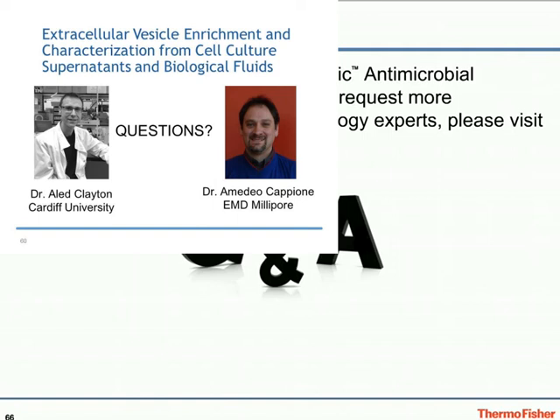Well, certainly it's a very valid concern. It will all, of course, depend on the cell type that you're working with and how sensitive they are to this kind of serum starvation. Certainly when you deplete serum from cells, you're altering a whole manner of factors which we won't really know and understand properly. And we know that the lipids in the cell can change and the whole manner of proteins can change in the cell. So the exosomes that they're producing will also change.